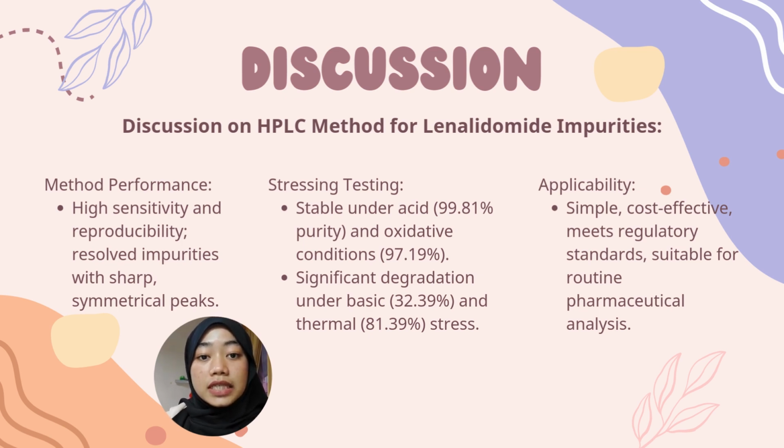Compared to previous methods, this approach is simpler, more cost-effective, and meets regulatory standards, making it ideal for routine pharmaceutical quality control. Overall, the method reliably evaluates both the impurity profile and stability of lenalidomide formulations.